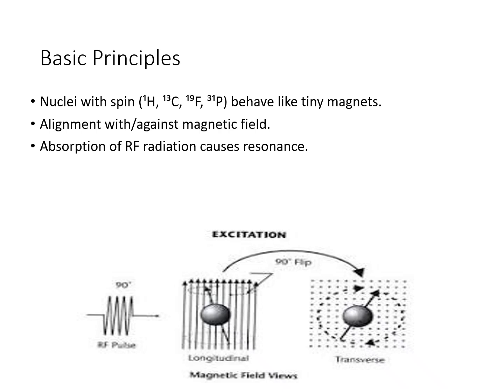This is called resonance. As can be seen in the diagram, by providing the radio frequency radiation, the nuclei absorb energy and flip into this position. That is called the resonance.